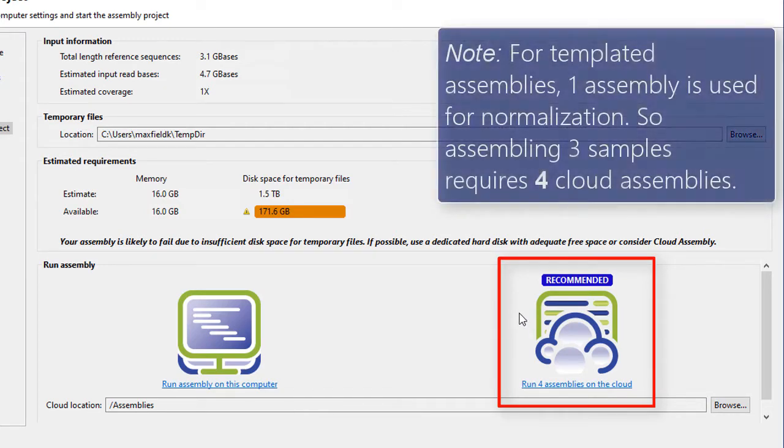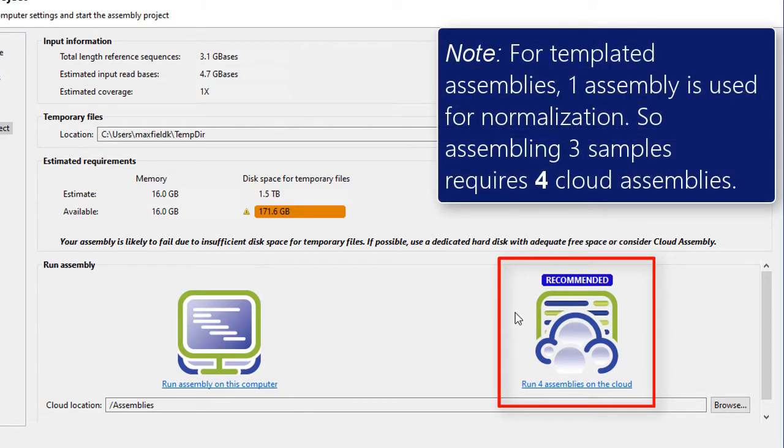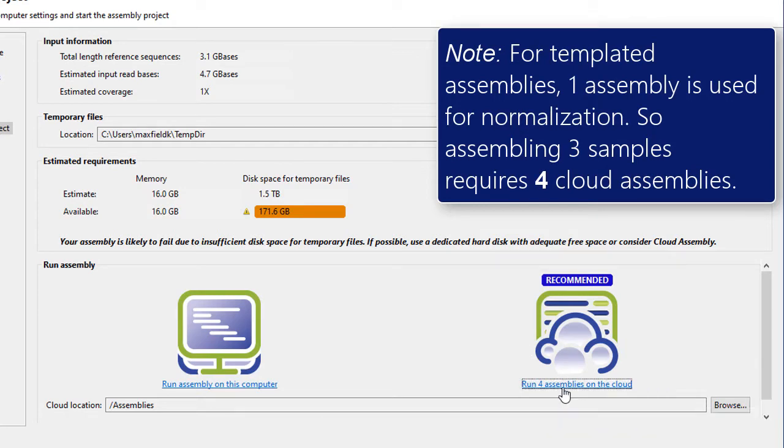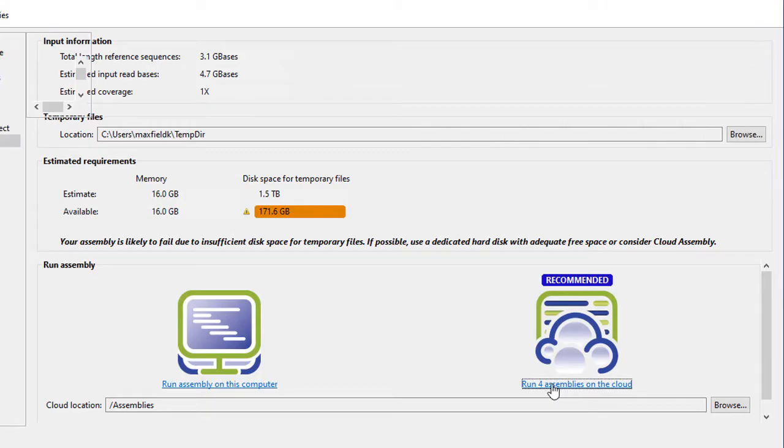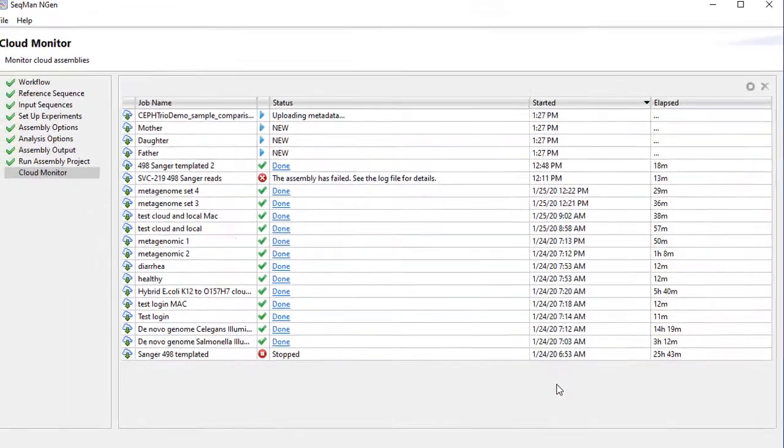Make sure you're logged into DNASTAR Cloud Assemblies, and then click Run 4 assemblies on the cloud. Or you can run the assembly locally on your computer if you have sufficient hardware.